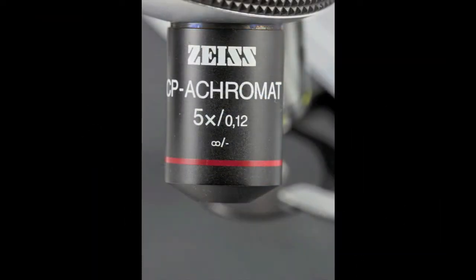You should always begin with the scanning objective, the one with the red band. This lens has the lowest magnification, and therefore the widest field of view and greatest depth of field. This makes it ideal for searching around on the slide to locate the object of interest.